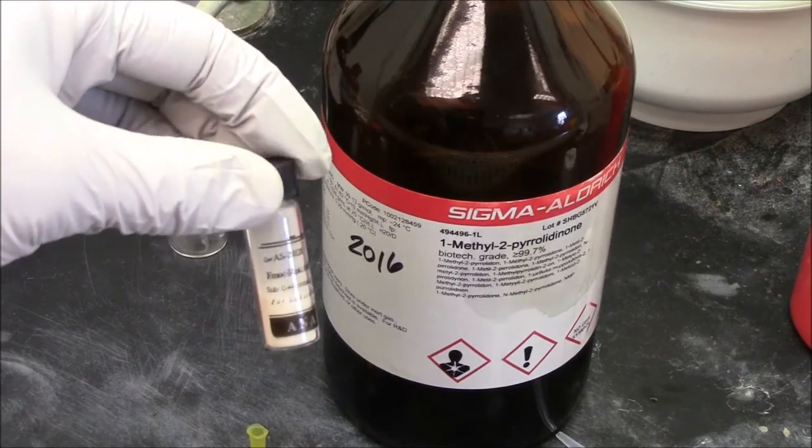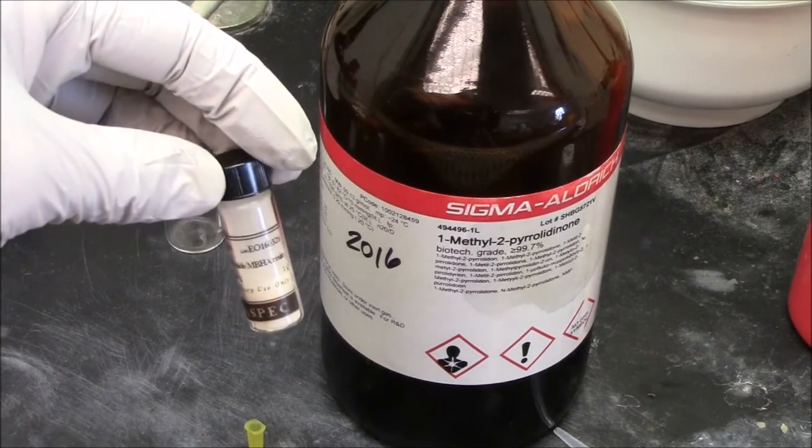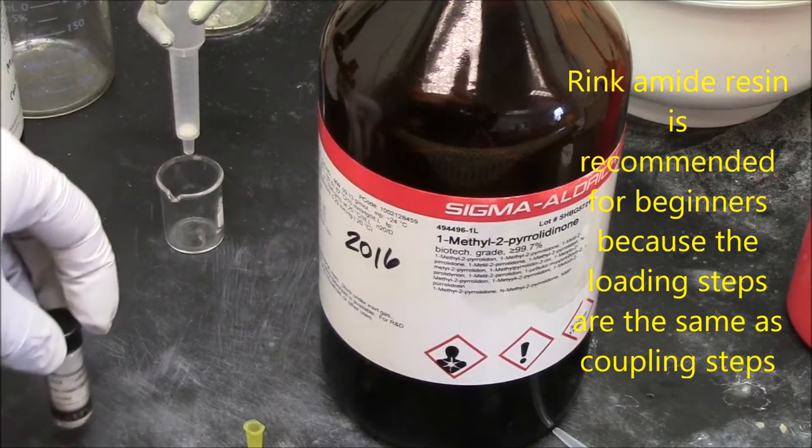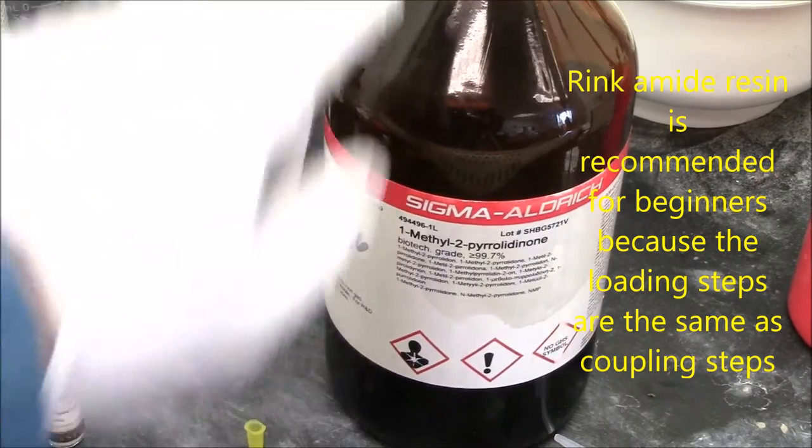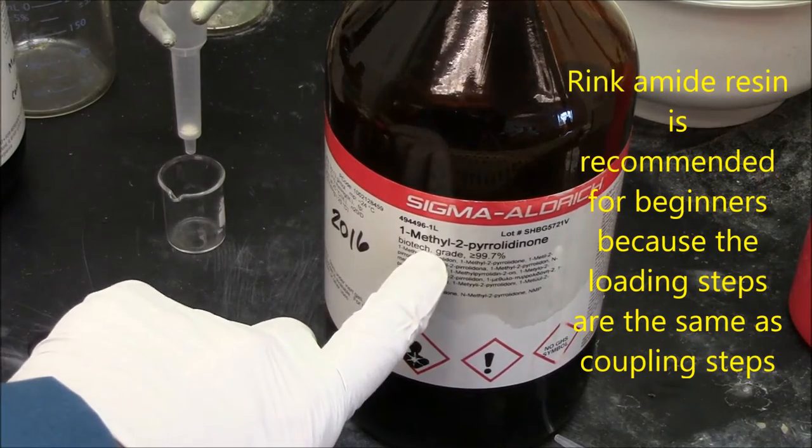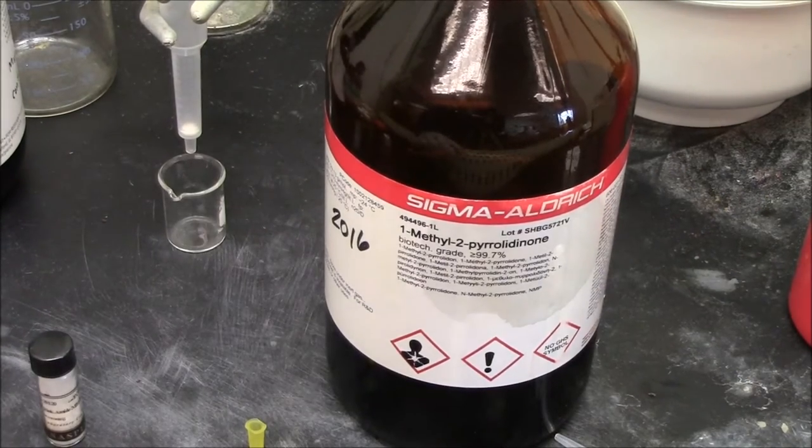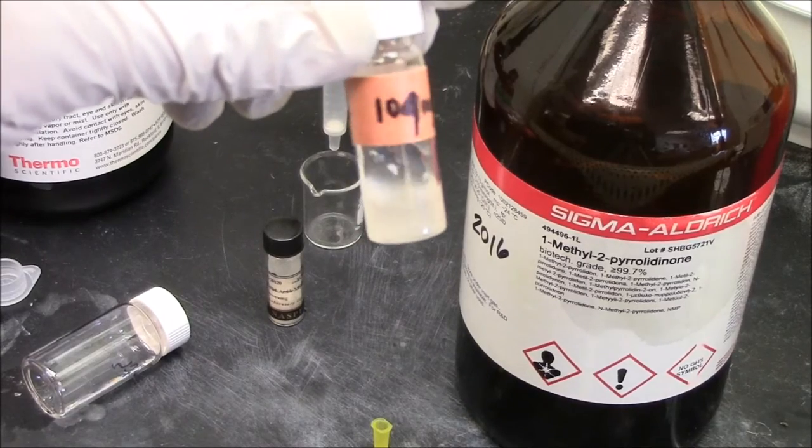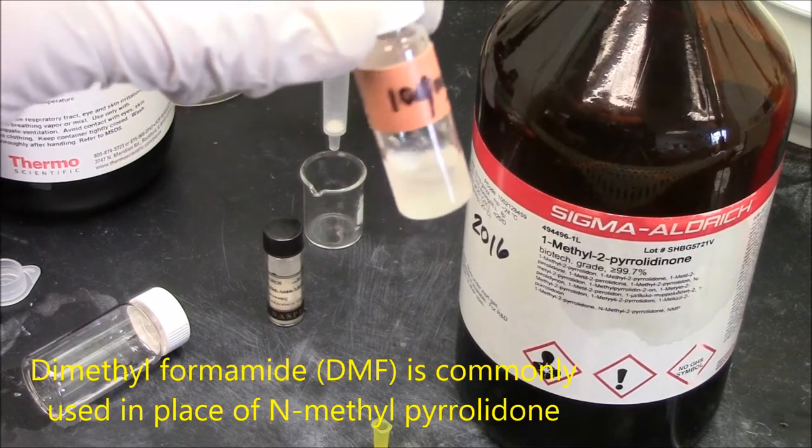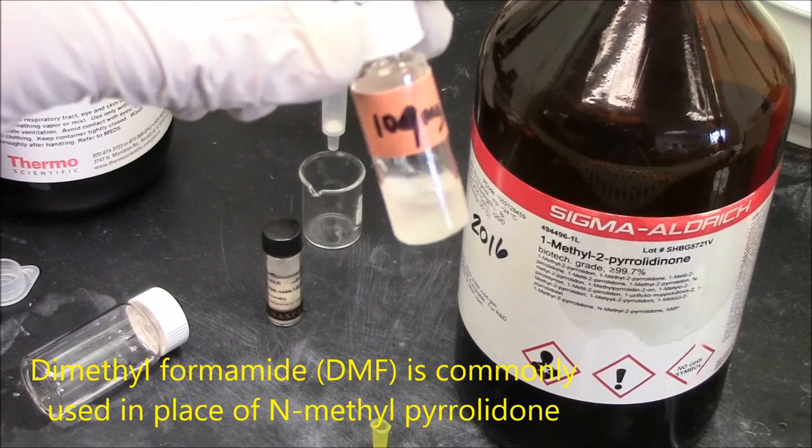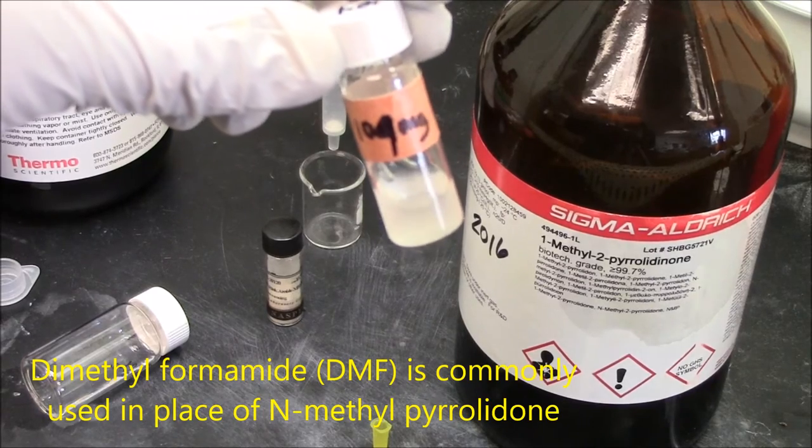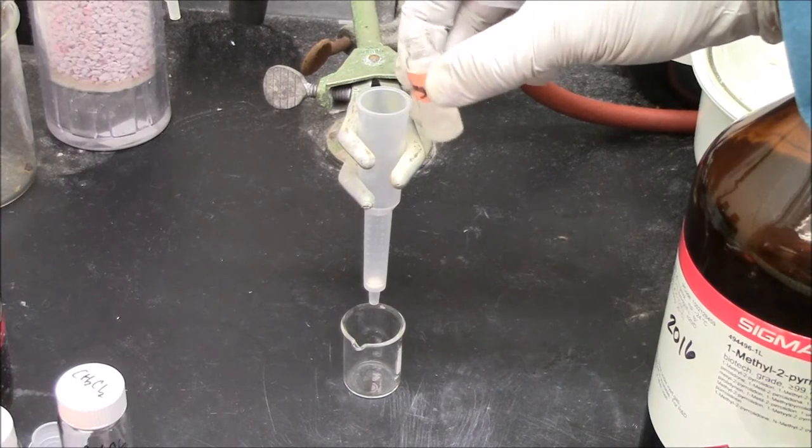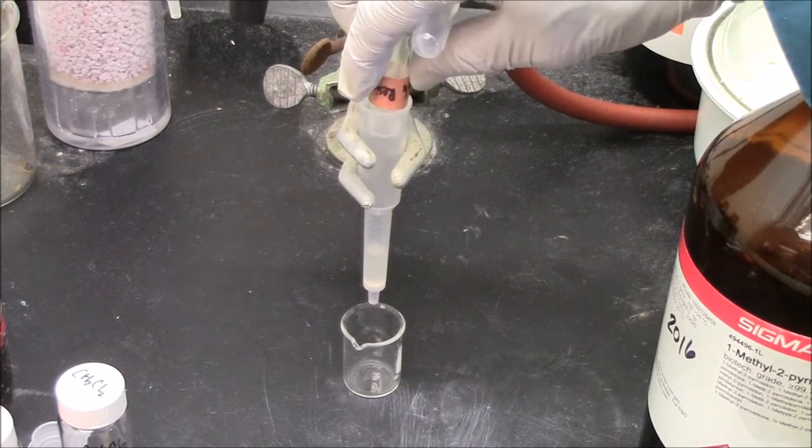I'm starting my synthesis with rink-amide resin here, weighed out 100 milligrams. It's a very fine sand-like texture, and the solvent I'm swelling the beads in is N-methylpyrrolidone. These beads have been swelling in the refrigerator overnight. The beads are slurry, almost like silica gel in organic solvent, so I'll dump them in.